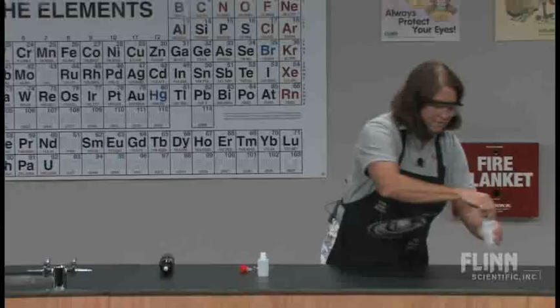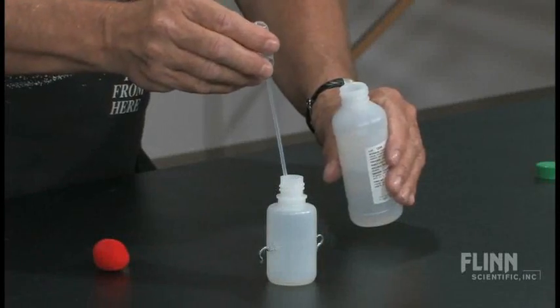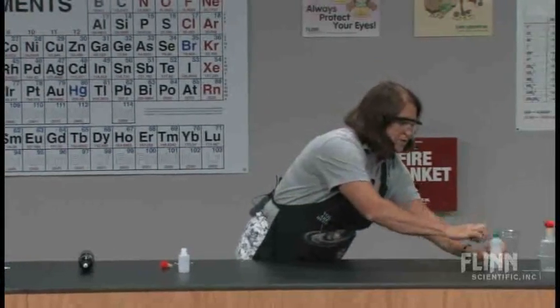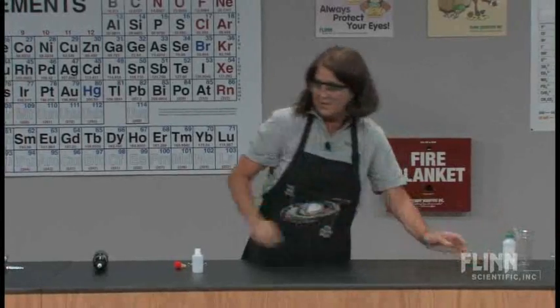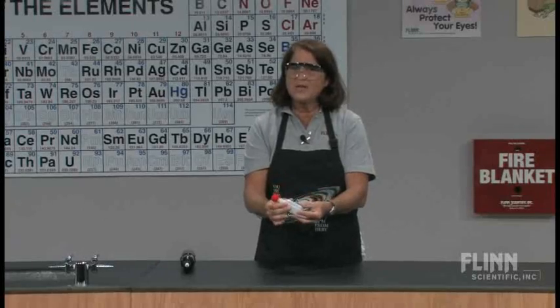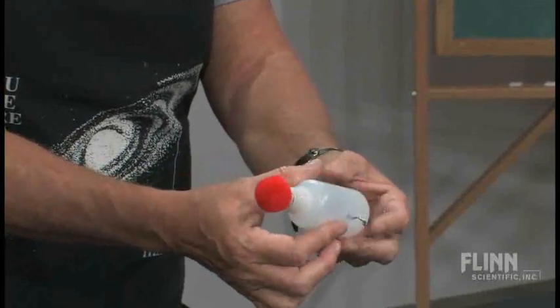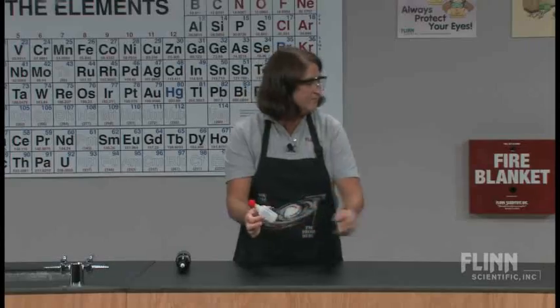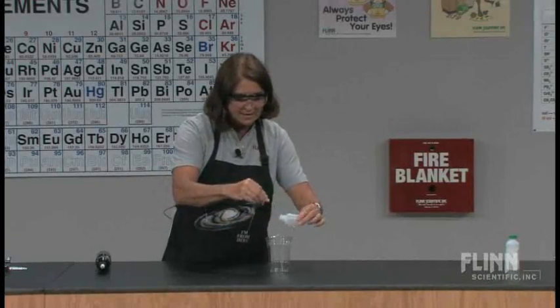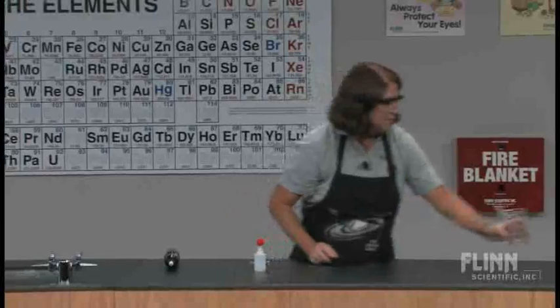Let's add some ethanol into the bottle. If it was good the first time, it's going to be even better the second time, isn't it? Cork on. As I pick up the bottle, I feel the heat from that reaction — the bottle's quite warm. Roll it around, let the surface area help it evaporate faster. Dump out the excess. We'll do it again.